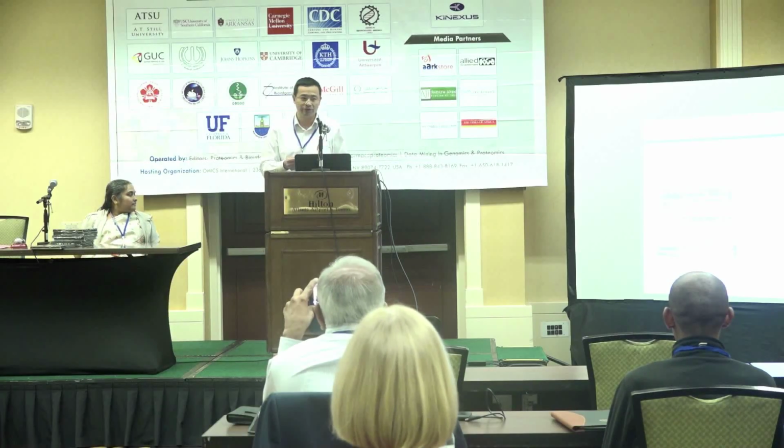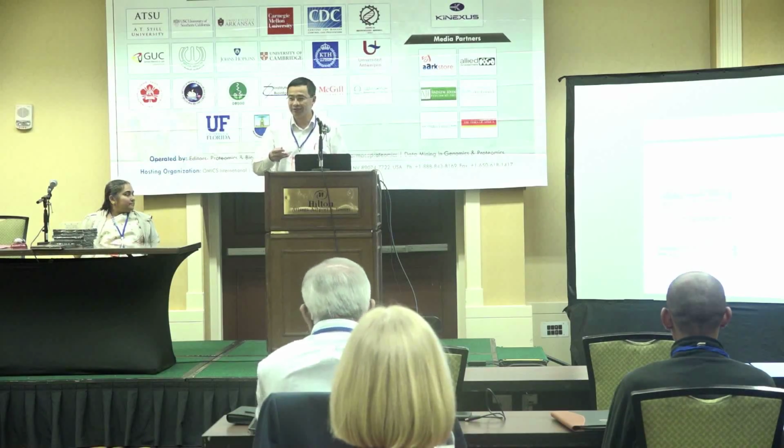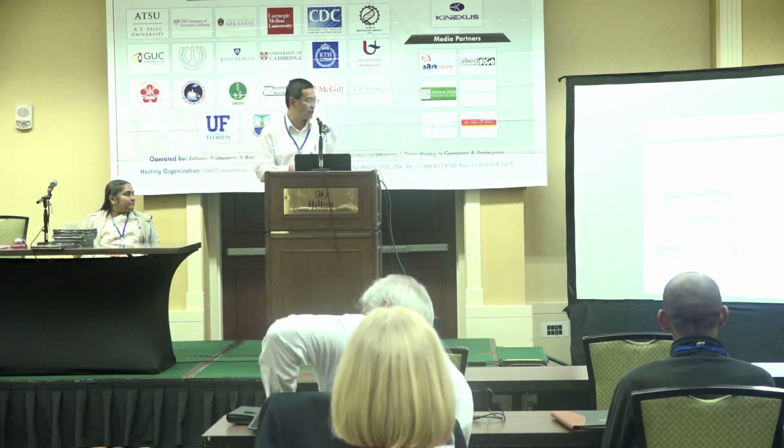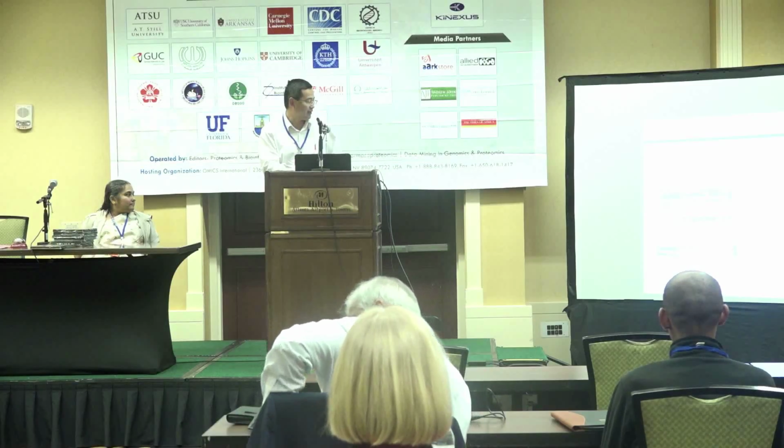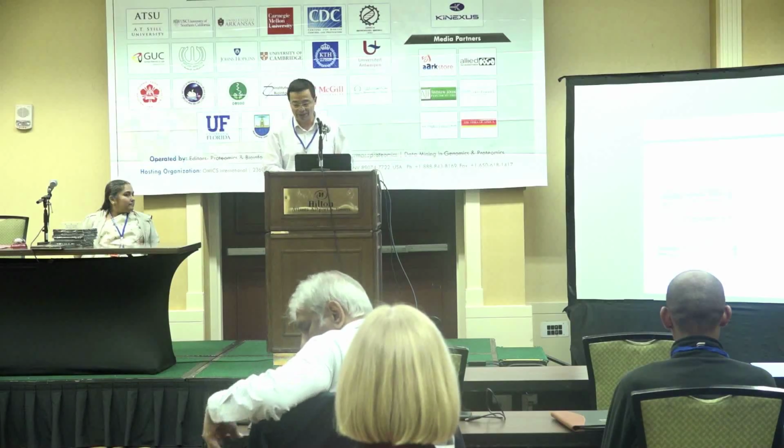Another technology we use is from Bio-Rad. It's called ProteoMiner. It's an enrichment procedure, so you can remove the high abundant proteins and enrich for low abundant proteins.